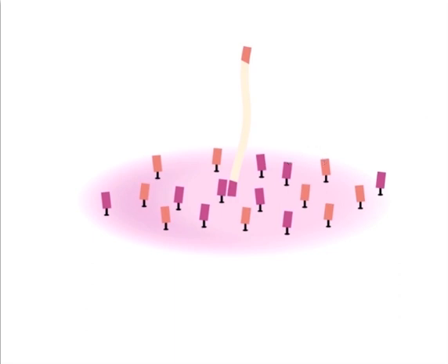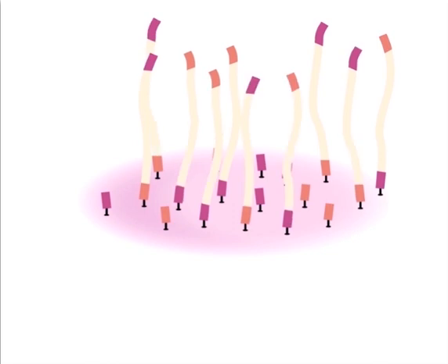In the next step, PCR, DNA polymerase synthesizes a second strand of DNA, starting from the annealed oligonucleotide, which serves as a primer. The two long strands are now separated, leaving one strand attached by a covalent bond to a fixed oligonucleotide. The DNA fragment can form a bridge with another fixed oligonucleotide, and another round of PCR proceeds. The strands are separated, followed by additional rounds of PCR. After many rounds, a small patch of DNA forms in the location of each original cellular DNA fragment.